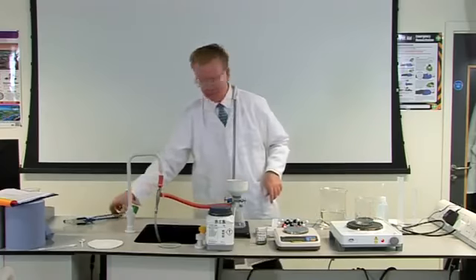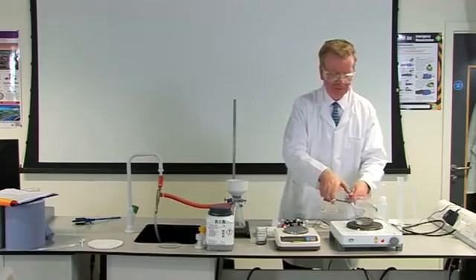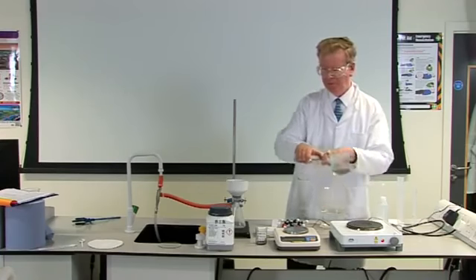Using beaker tongs or suitable gloves to hold the hot beaker, quickly filter the boiling solution by pouring it into the Buchner funnel.